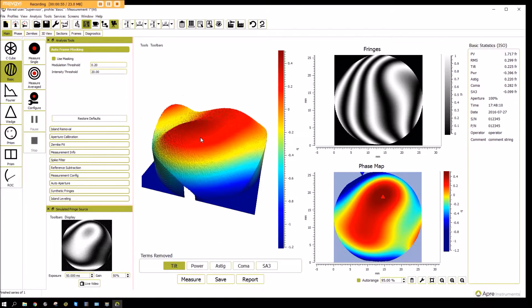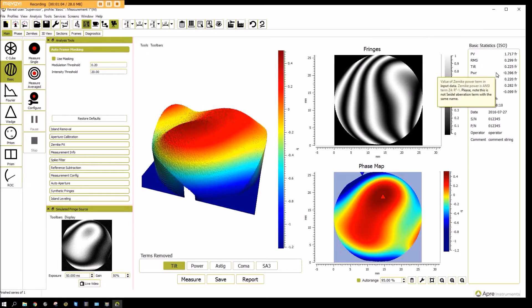The results include a 3D plot, fringes which are like a Newton's ring — they're synthetic fringes — a phase map, and again the results shown here.